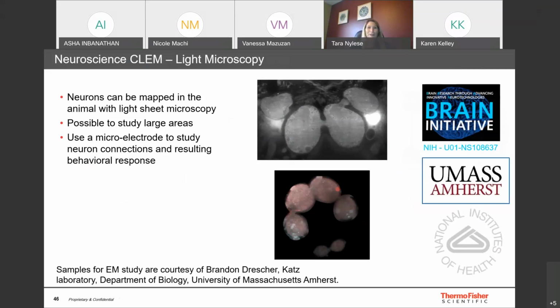So I just want to wrap up with a few scientific examples of where the VolumeScope and related techniques are being used to deepen understandings in science. And so what we're looking at here is work on the Brain Research Initiative through NIH. And Vanessa and one of our users over at UMass Amherst have been partnering together, submitting some samples to our nanoport to collect some data, and all of this supplements the work that they're doing with the NIH on the Brain Initiative.